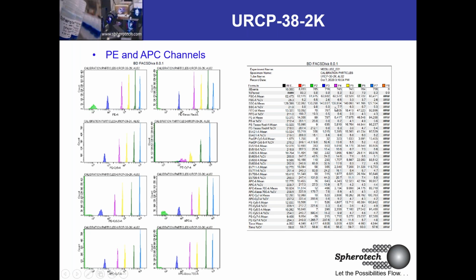Some people will mention, oh, this is an exponential curve. Do we have to apply an exponential formula in order to determine where we're going? And what I usually respond with is that we're actually going to do the inverse. We're going to use a log in order to linearize it. The first log that we apply, you don't necessarily need to think too much about this, but the first log that we apply is based on the actual number of bins per bit, the electronic capabilities of your photomultiplier tube or your avalanche photodiode. So we account for the number of bits.